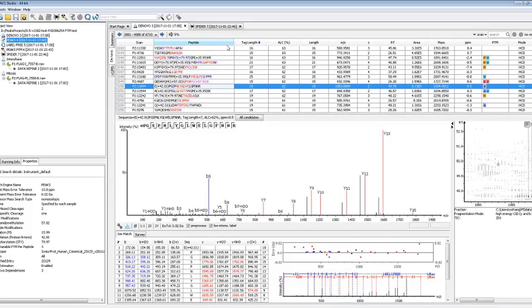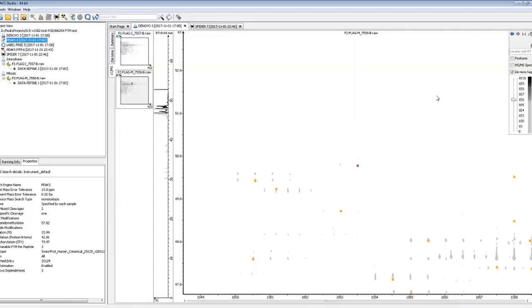Some other additions that we have in more recent versions of PEAKS is you'll notice that you have this area column. And this can be useful in giving you an idea of the abundance of certain peptide features in comparison to others. And we actually have this area column in all of our identification modules of PEAKS. So this can be used for a few things, such as PTM profiling, and give you some semi-quantitative features. And I'll quickly show you what this area actually comes from.